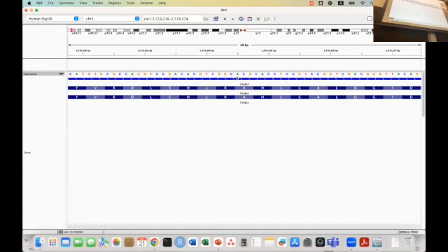You just consider U as a key. Yep. So I hope that this addresses all the concerns about how to utilize the genome browser, especially the DNA sequence and codon table, gene in the forward direction and gene in the reverse direction.